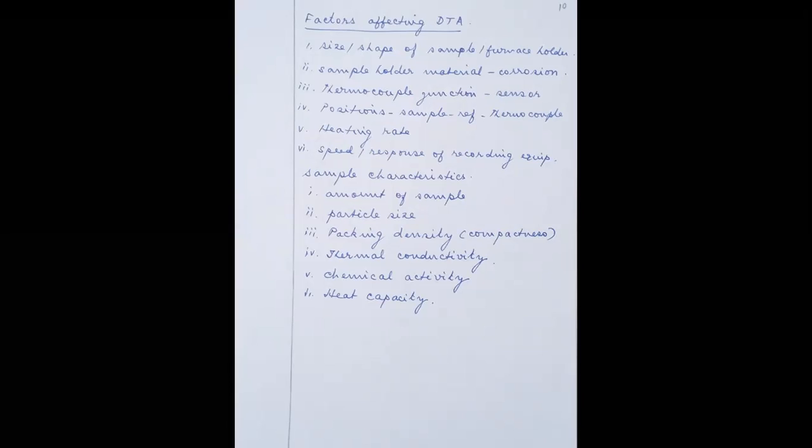So normally the temperature change or the heating is a surface phenomenon. So when the particle size is very small, then the heating will be very efficient, and the particle size is very big, then the heating will be less efficient. So even though you are having only one particular type of substance, depending upon the particle size, it will change.